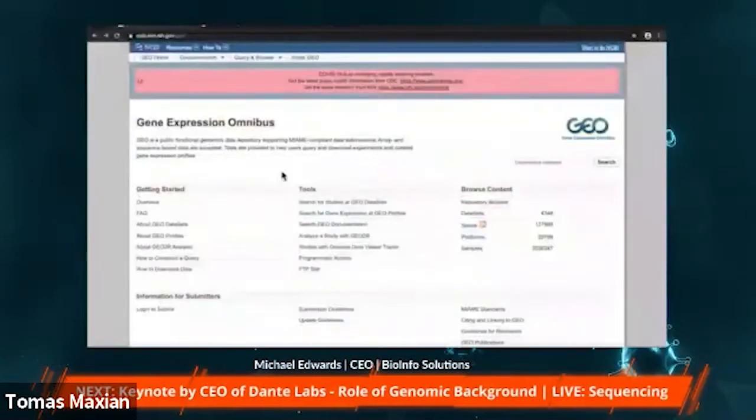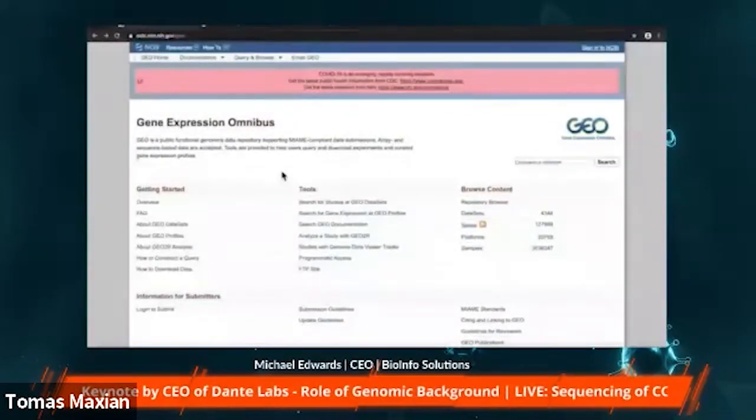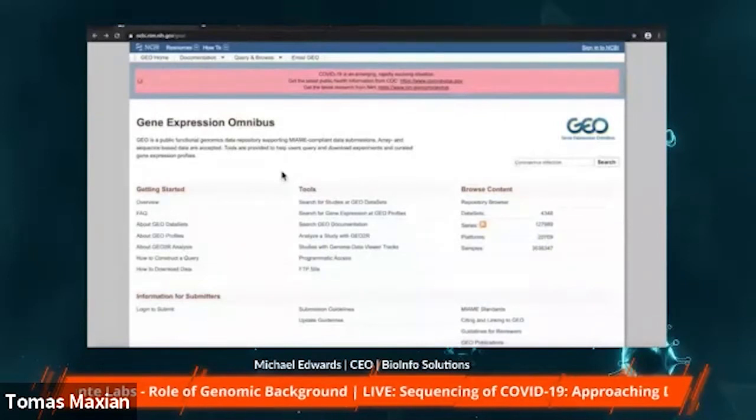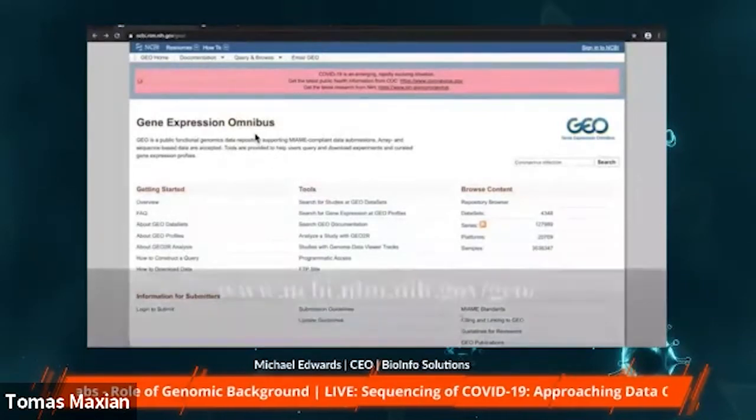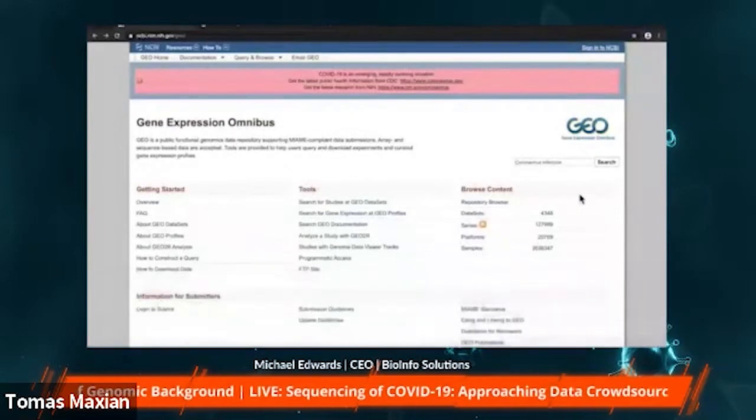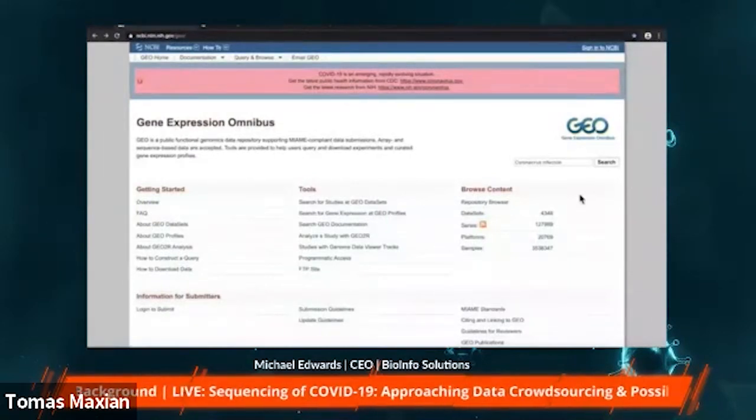In this section, we will go over collecting the data used in this meta-analysis and preview some of the tools used to gather this information. I am starting out by showing you the screenshot of the website Gene Expression Omnibus, or GEO for short. This data repository is where most of the data that is generated by federally funded grants is located.